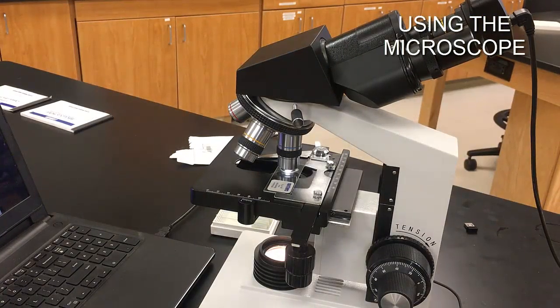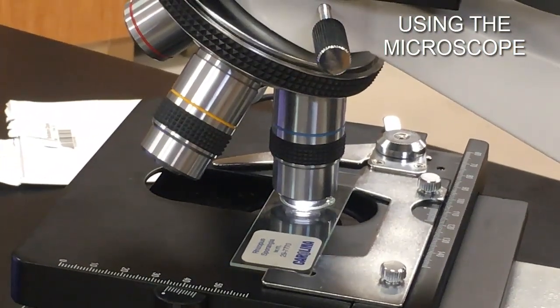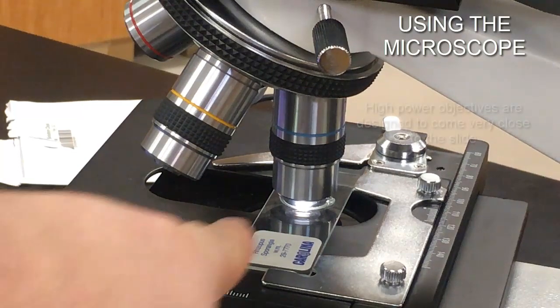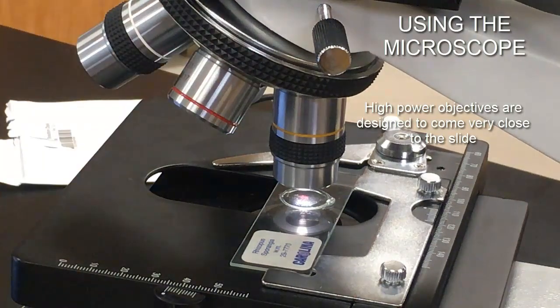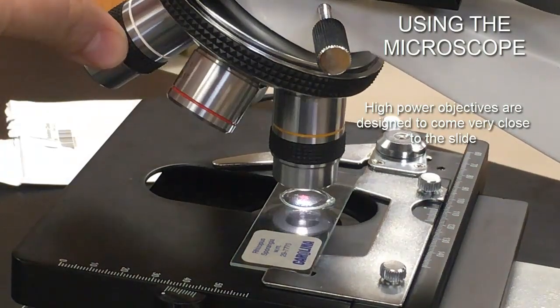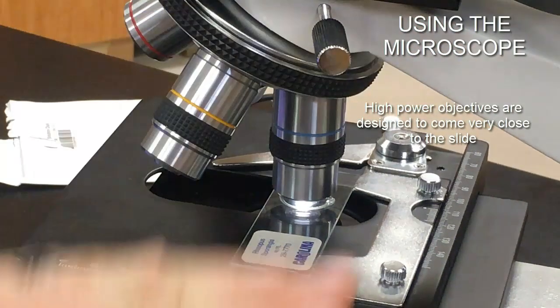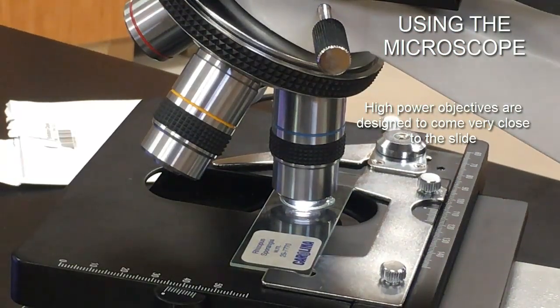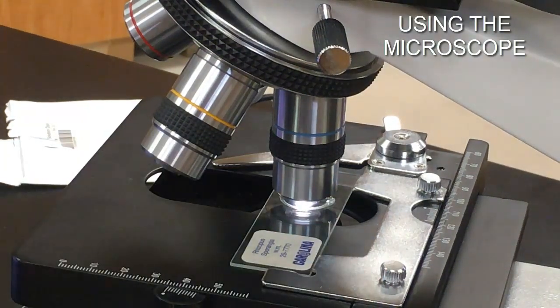Once you're at the 40x objective, you don't want to lower the stage out of fear of hitting the objective. As long as you're in focus with each objective when you make the next transition, you won't cause any problems. The objective is meant to be right on top of the slide like that — that's intentional.